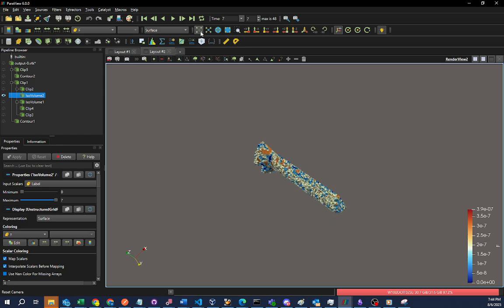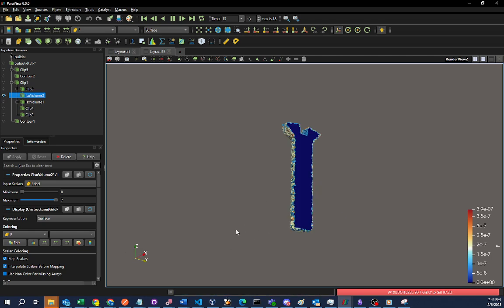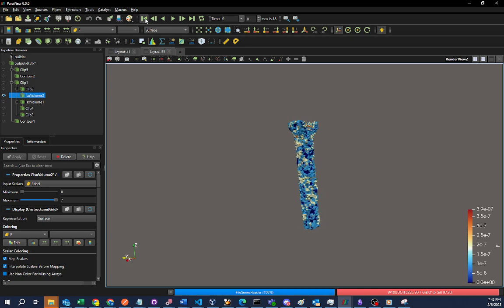You can actually see as it goes up, the fluorine kind of penetrates the screw, but not all the way. Because I believe how they did it is that they measured it by distance, and so there's no fluorine inside the screw, but you can see it kind of covers the screw.